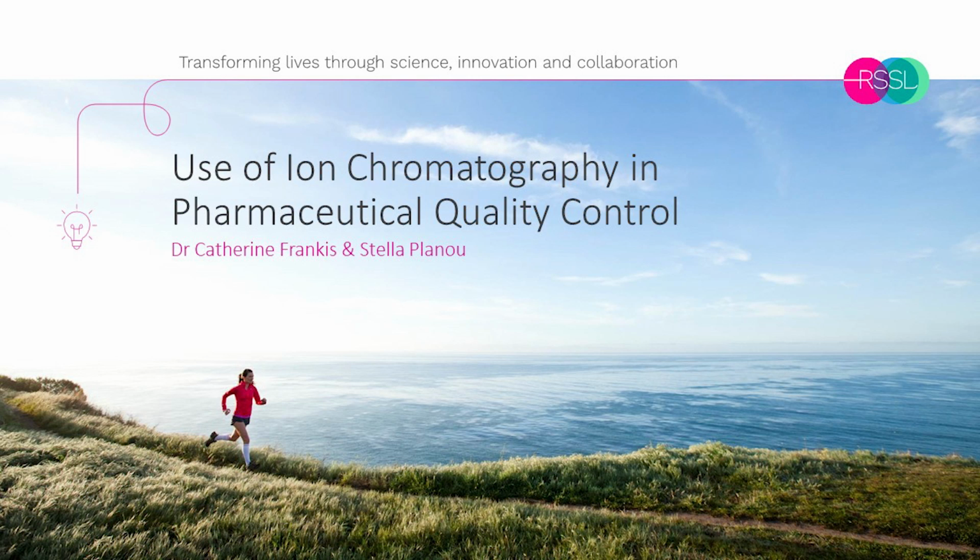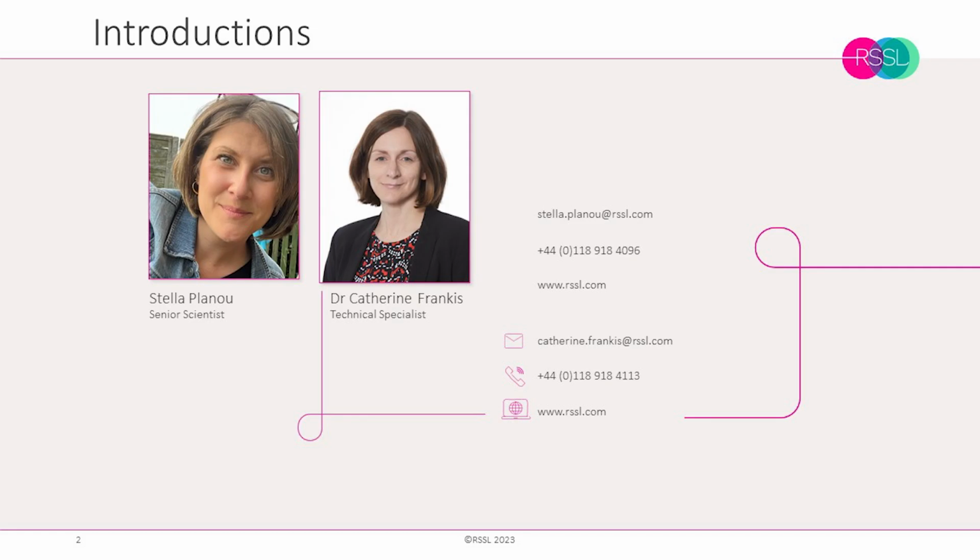With me today is Cathy Frankis, who is a technical expert in chromatography and spectroscopy. Today we'll go through the use of ion chromatography in pharmaceutical quality control.